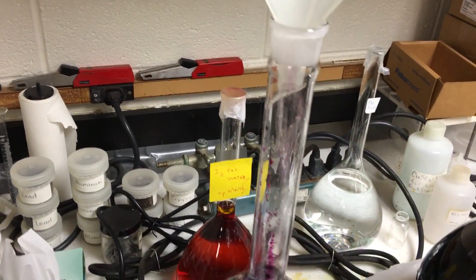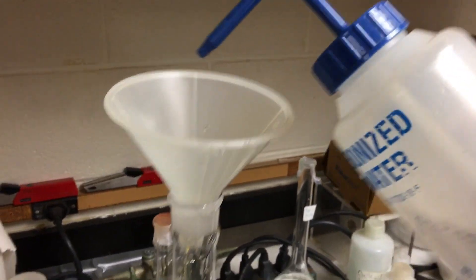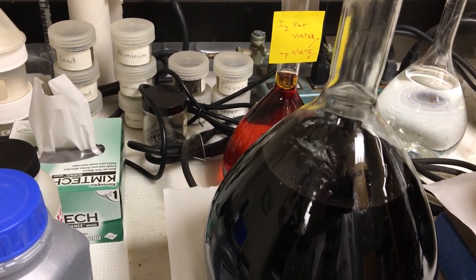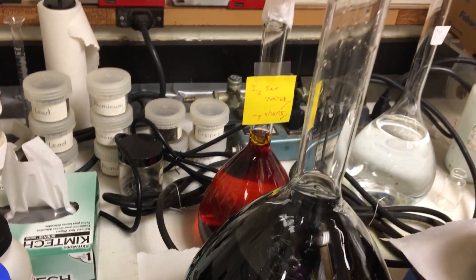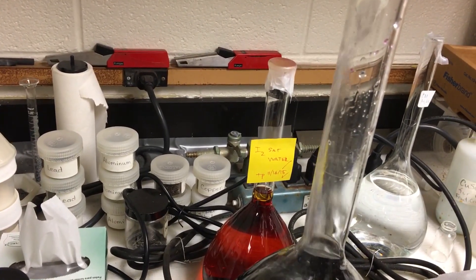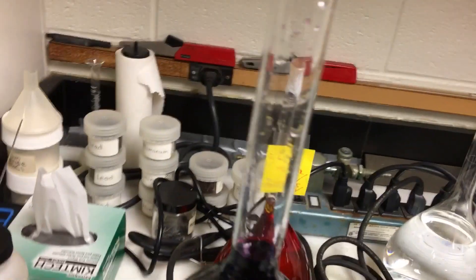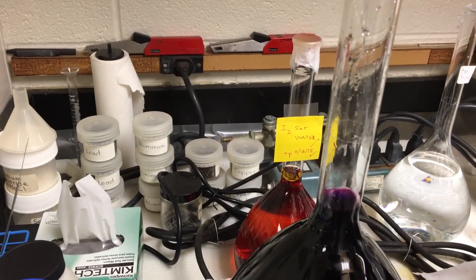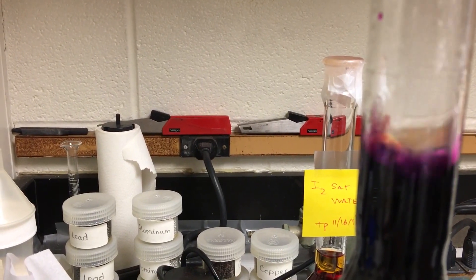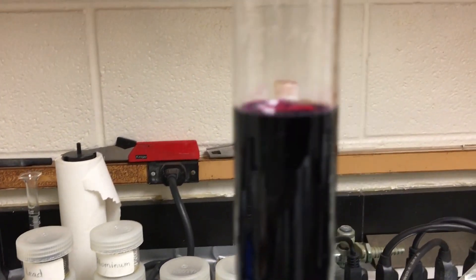Next step: I squeeze the DI water bottle here — very, very carefully — you cannot go overboard. Bring it all the way up. Getting close — and remember the meniscus: you need to read the bottom curve of the meniscus. About there — I think it's good enough.